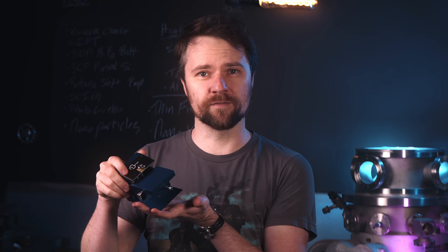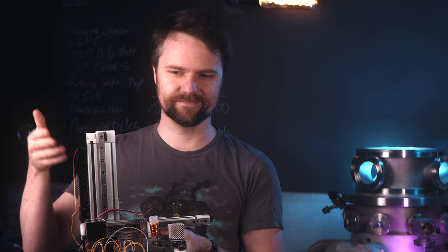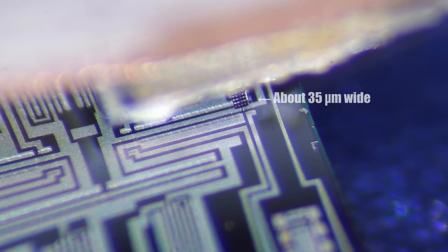Today I've got not one but two different machines to show you. I have the actual atomic force microscope, which has literal nanometer precision. And then I have this thing that I built, which doesn't have nanometer precision at all. I built this macro AFM as a demonstration model to show how the principles of atomic force microscopy work, because the real AFM has the cantilever and probe on the end of a PCB and you can't really see the cantilever — even under a high magnification microscope it's really hard to see the little cantilever doing its thing.